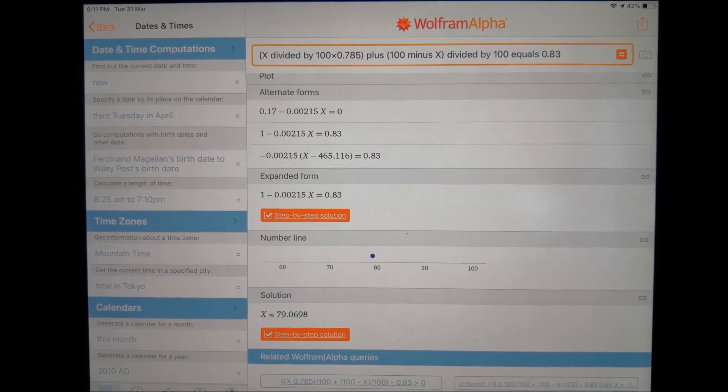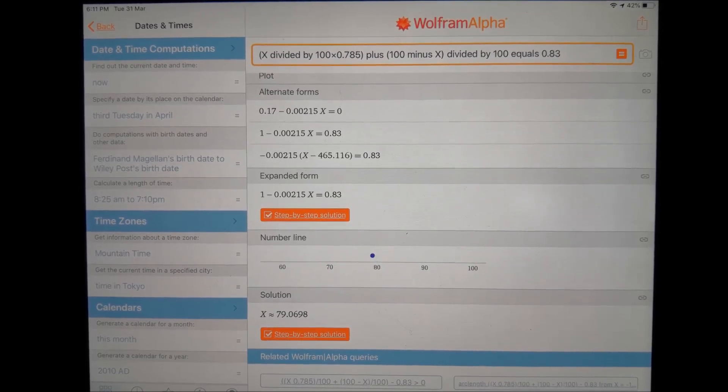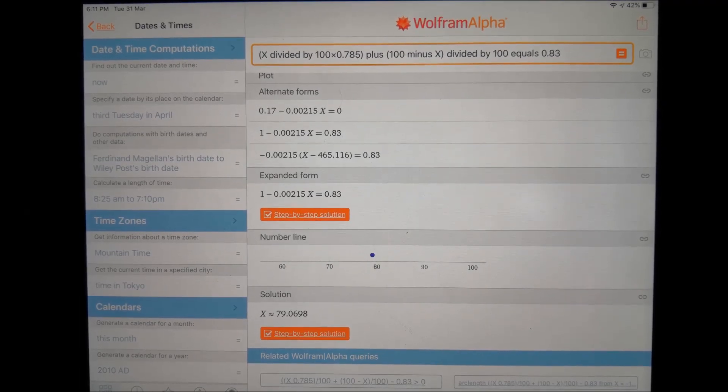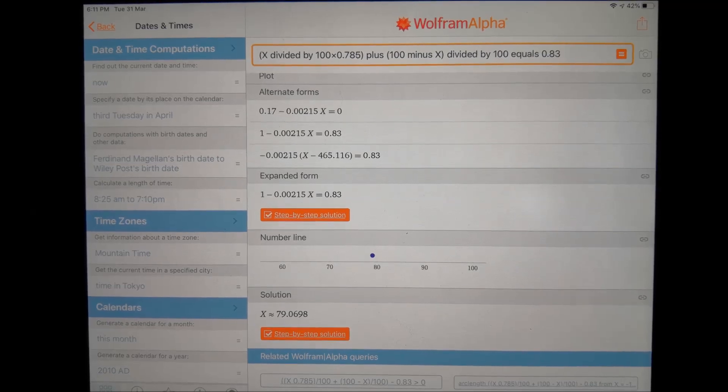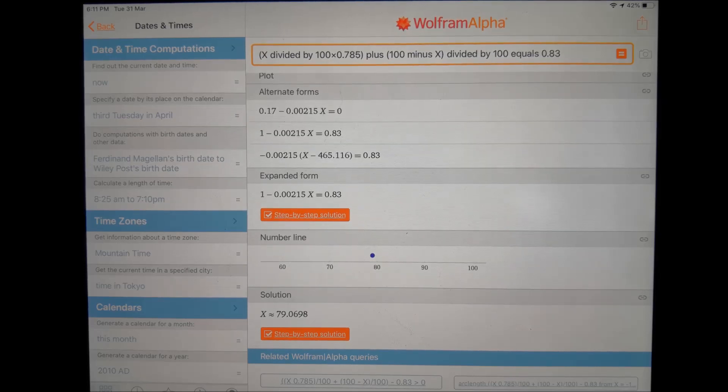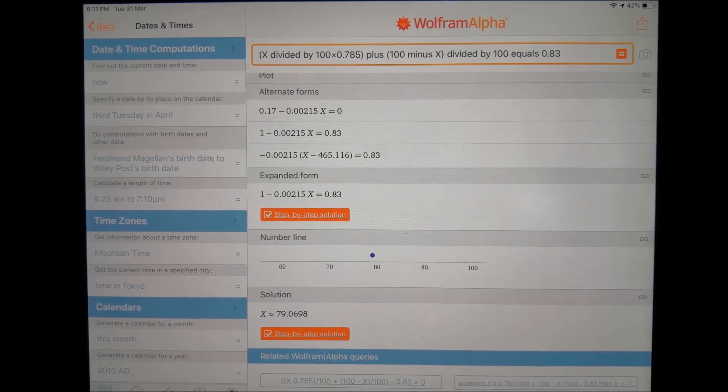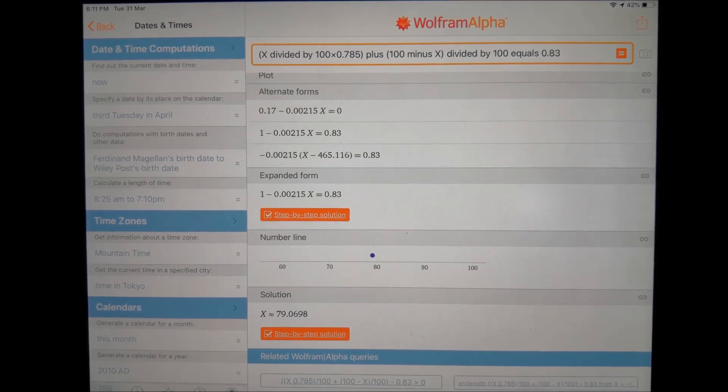So again, this is within the realm of accurate. It's definitely not off by a huge amount, the percentage of alcohol. So I'm definitely happy with this one. I'm sure that, you know, nobody's watering it down by 50% or something like that. If it were watered down by 50%, we would definitely notice it. And it would have shown up in this type of analysis.